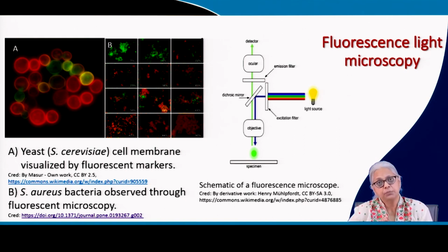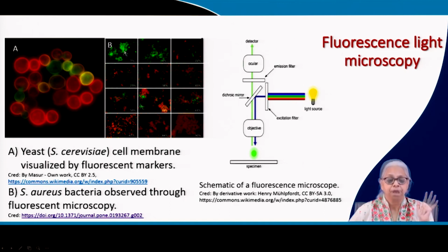Now, if the cell membrane is intact, it means the cell is likely to be alive and viable and capable of reproducing. On the other hand, if the cell membrane has been damaged, then the reaction to the fluorescent dye is going to be different. The color that is caught in this case is red. In the case of the living cells or intact cell membranes, the color is green, and that is because of different dyes reacting in a different manner.